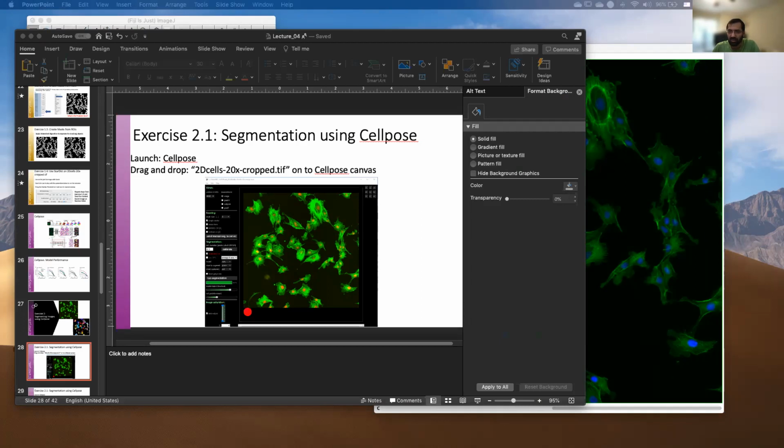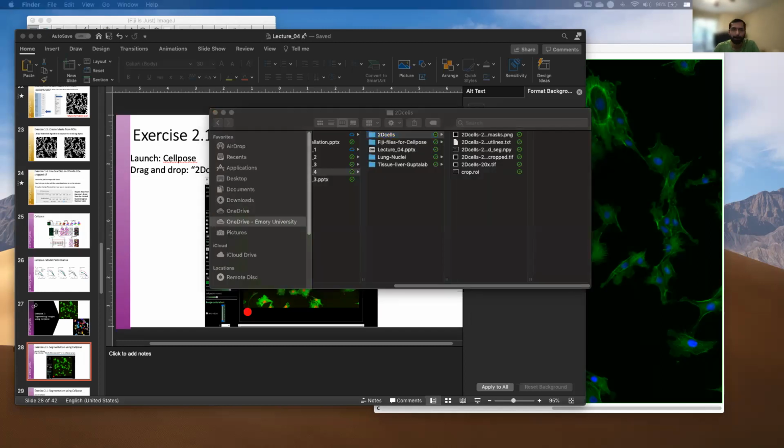That's fantastic. So for some weird reason, my terminal would not recognize that I have a downloads folder on my computer, which is not fun, which is what I need for this entire demo.